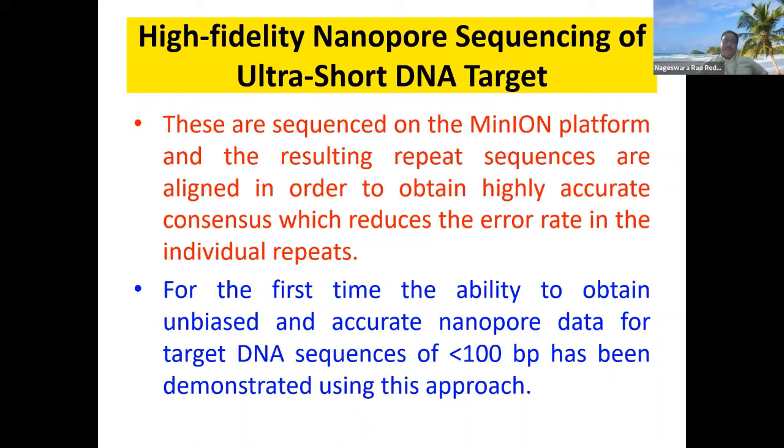At the same time, the accuracy is high when compared to the previous one. Okay, so we are able to sequence sequences which are less than 100 base pairs.